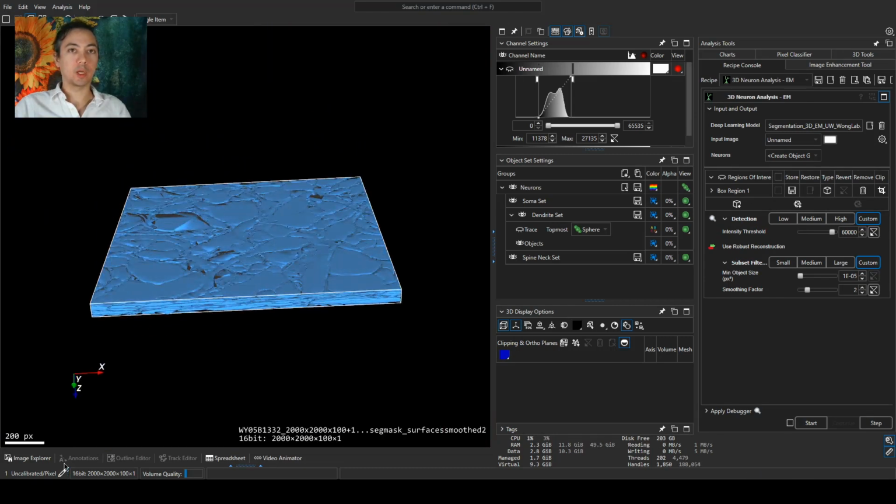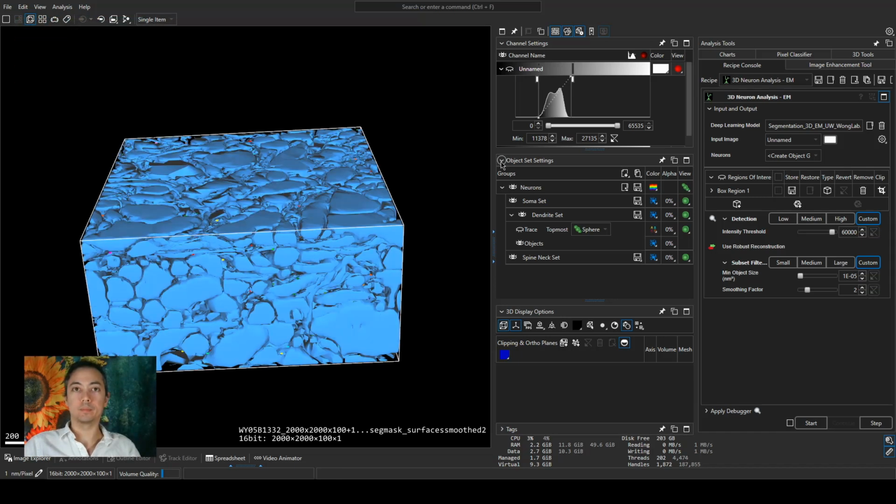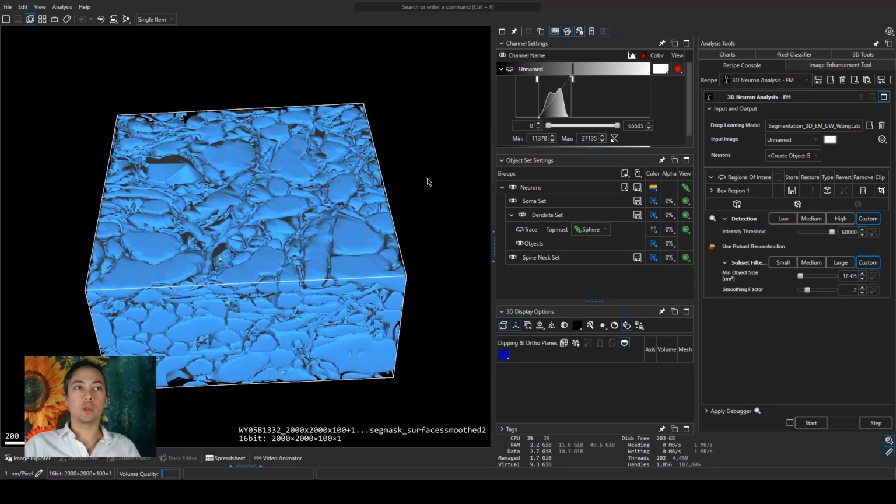And we'll set some calibration here. And so these are the results from the recipe. It'll output something like this. And one thing to note is they look a little funny because they're low LOD models. That's to keep the memory footprint down.